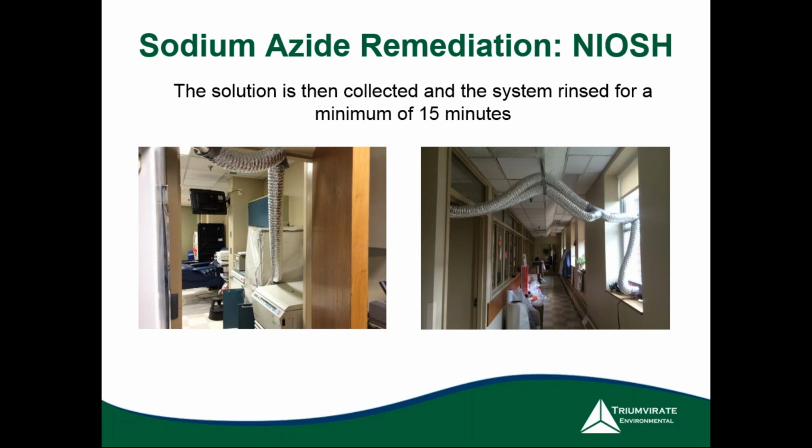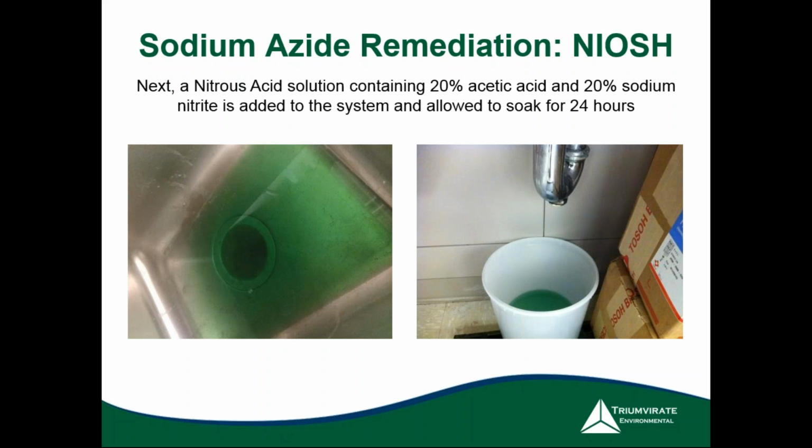So once that system is flushed with water, a nitrous acid solution containing 20% acetic acid and 20% sodium nitrite is added to the system and allowed to soak for 24 hours. You can see from these photos that nitrous acid has a distinct greenish blue color. It's pretty unstable, and it decomposes quickly in solution to nitrogen dioxide, nitric oxide, and water.